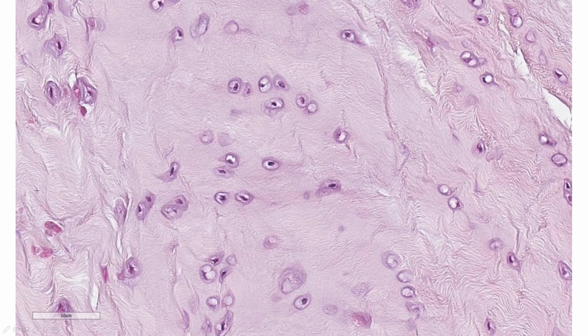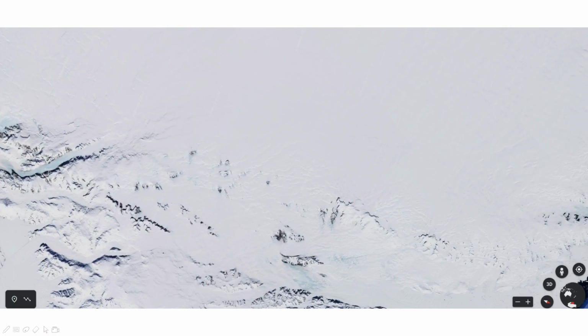This looks like Antarctica. As crazy as it sounds, it will help you to differentiate this cartilage from the other two. Can you see the resemblance? It might be a stretch, but if it helps you on the test to identify it, then it's worth it.